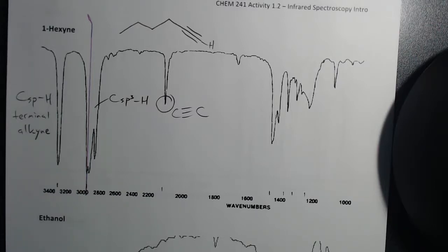The downside of this peak is that certain types of OH peaks show up in the exact same spots. But there's ways to differentiate between whether you have an OH there or if it's from a triple bond. We'll see that in later examples. There is a way to distinguish between them. But you have to be cognizant of that as you're working, that could be an OH, that could be a CH.